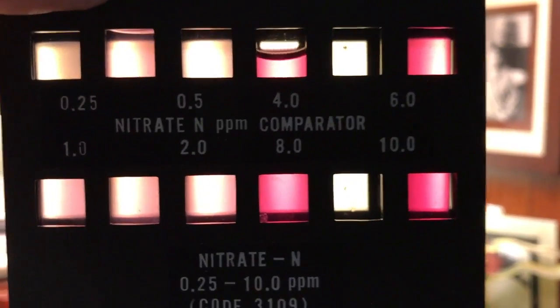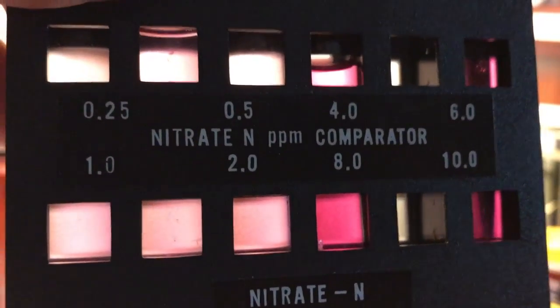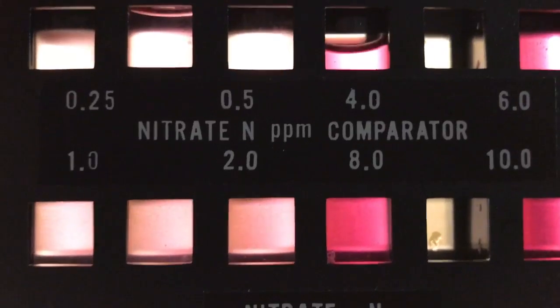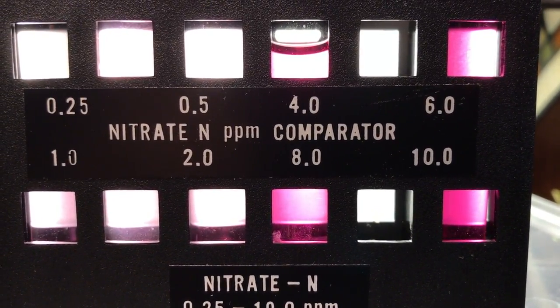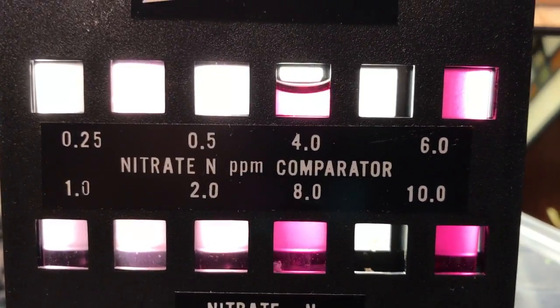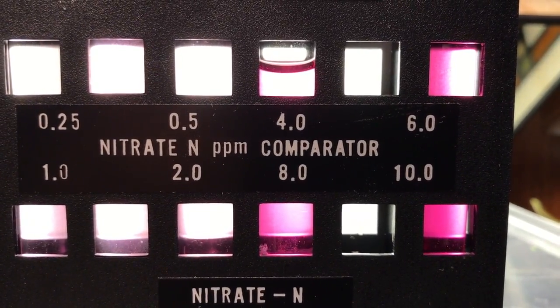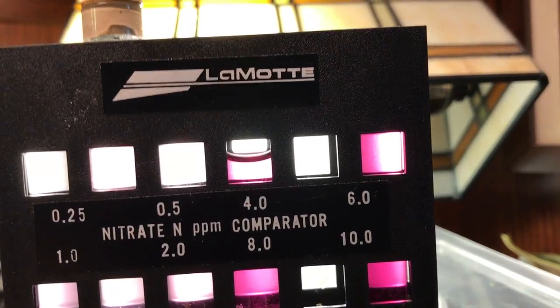This is what universities are going to use, this is what I use. A limnologist and ichthyologist is going to use Lamotte. I taught at universities and this is what we all use. When someone pulls out a Lamotte test kit, you better start sweating — because if you're claiming zero ammonia, zero nitrates, or zero phosphate, you better be pulling out a Lamotte. API test kits? On a scale of one to ten, ten is a Lamotte and one is an API. Lamotte is sold at all professional supply houses. Nobody fools around with API, Jungle, or Tetra.